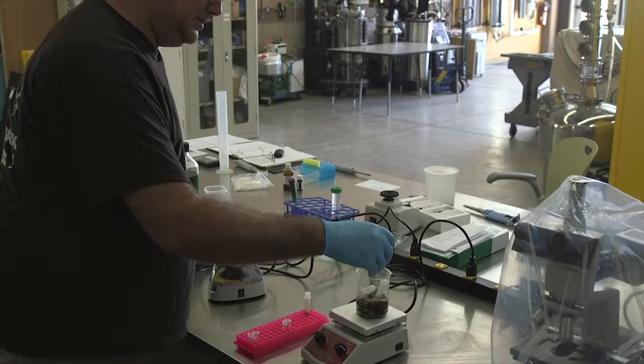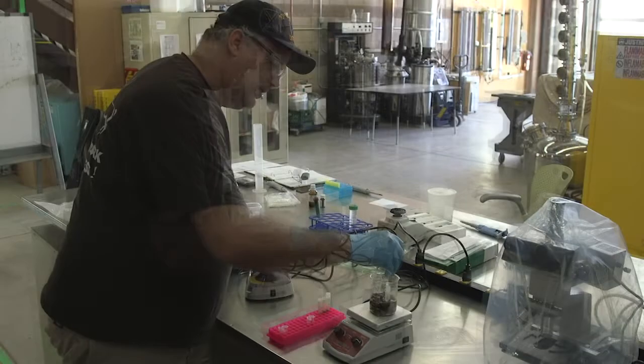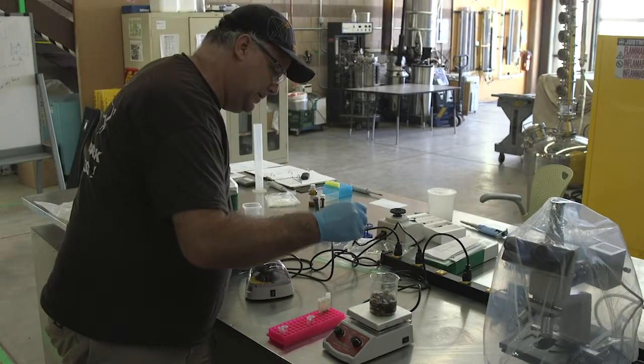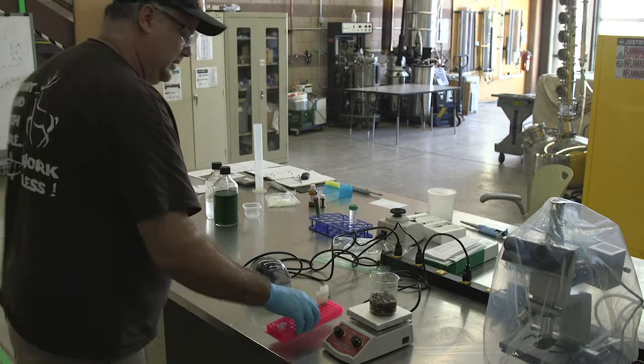When they're boiled, after five minutes, we need to take them out so we can go to the next step. I'll have to boil it again in a minute, so now we've got to go to the next step.